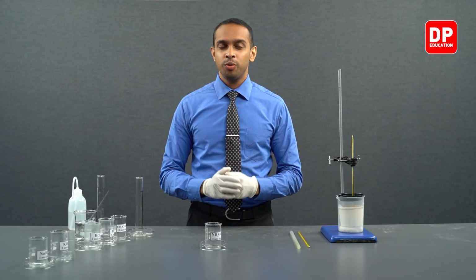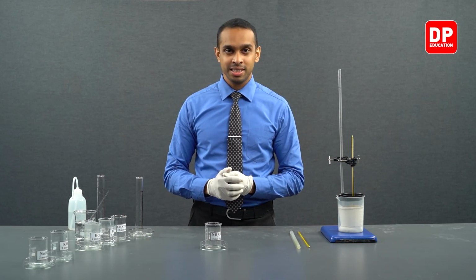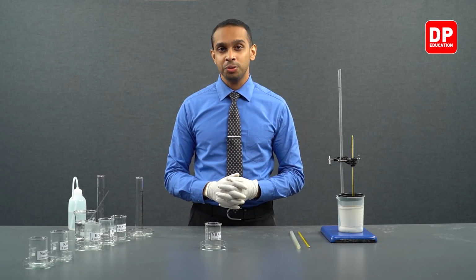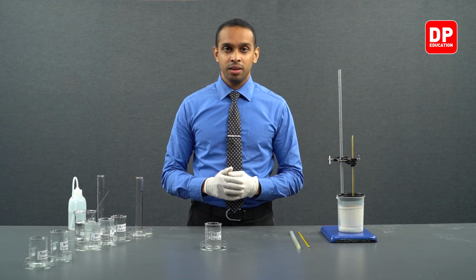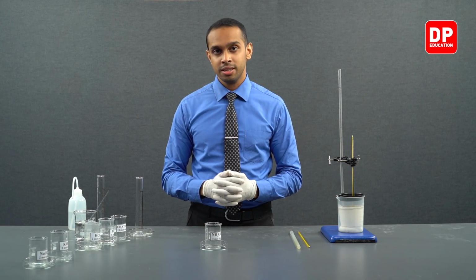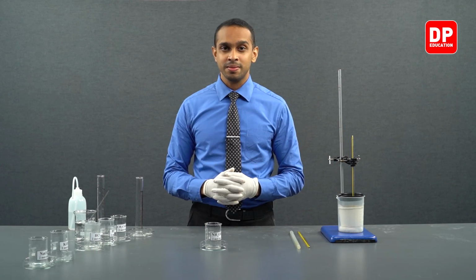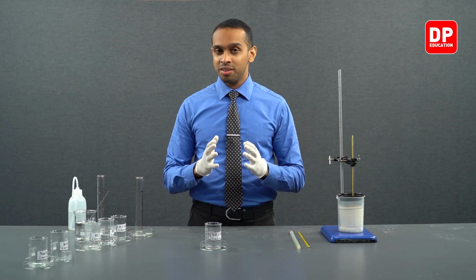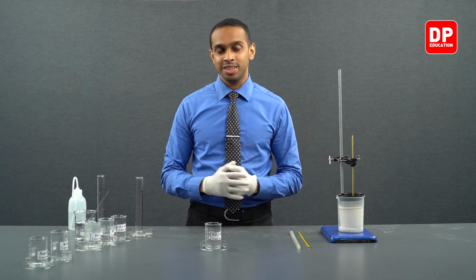Now, we have allowed the reaction to take place for over 2 minutes, and we observe the highest temperature that it reaches is 34 degrees Celsius. The acid had an initial temperature of 26 degrees Celsius. The base had an initial temperature of 22 degrees Celsius. And after mixing it, the final reaction mixture reaches a highest temperature of 34 degrees Celsius.